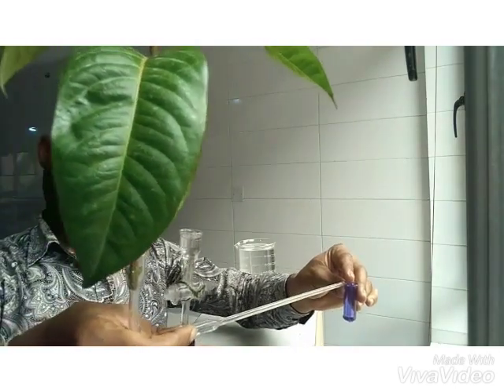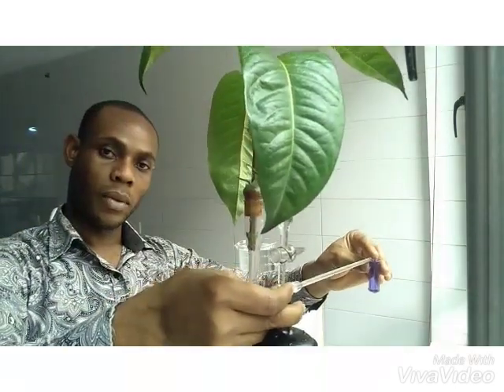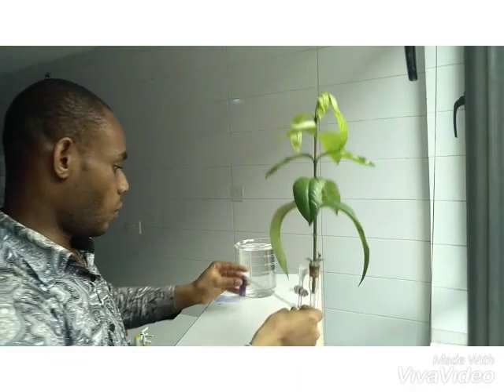We're going to leave this for one to two hours and then come back to check. So we are back again to look at the result of our potometer experiment. Here I have the potometer, and I want you to look closely.